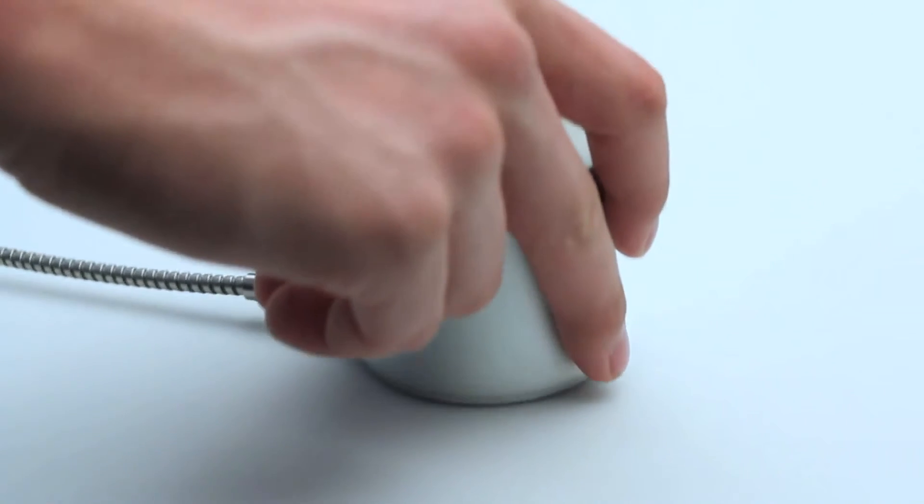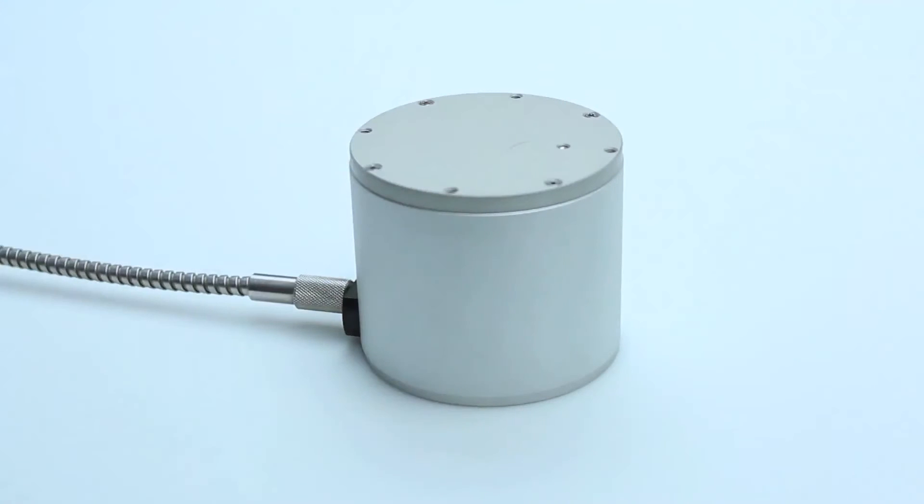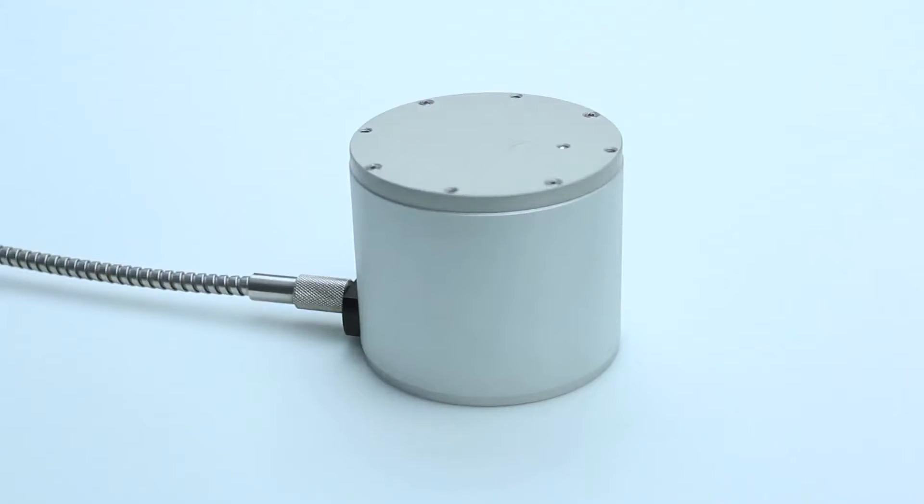Make sure there is no light that can enter the sphere. Take a dark reference.